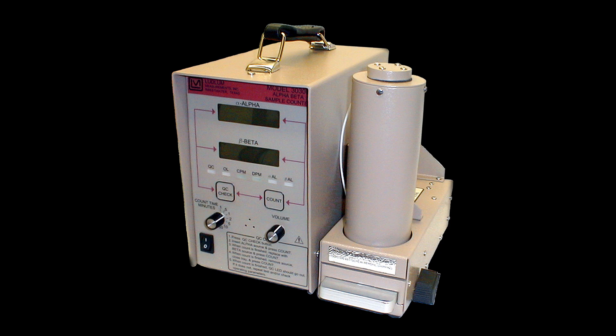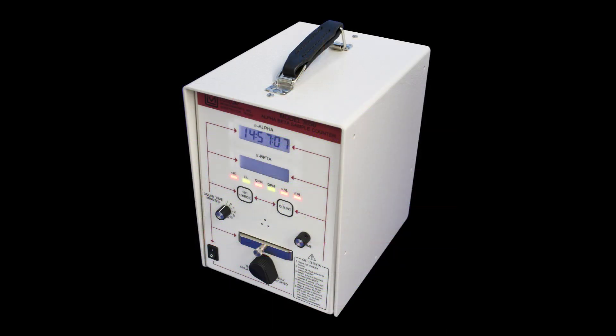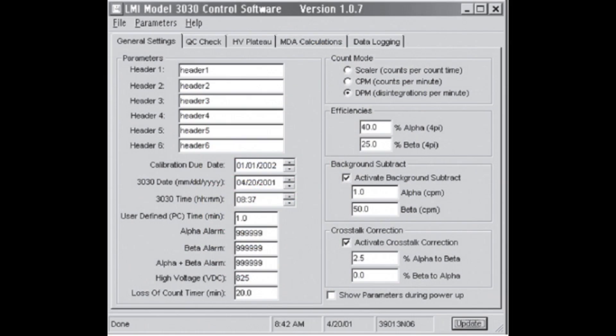Some versions have slightly different features and configurations, but the operating procedures are essentially the same. This video is for basic use of the instrument as shipped from the factory. All parameters are set for factory default settings. Advanced features will be demonstrated in a later video.